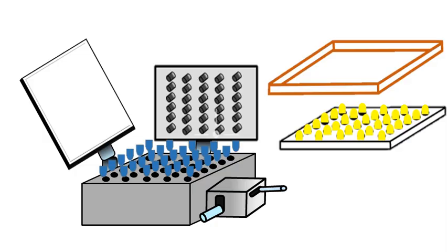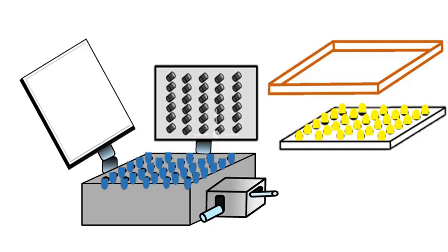Now move the Cam Handle in opposite direction so that the body of capsule in the bed moves downwards.